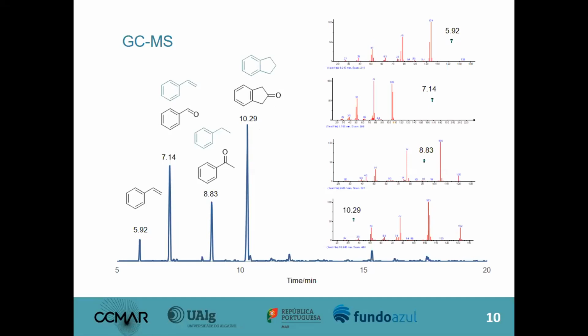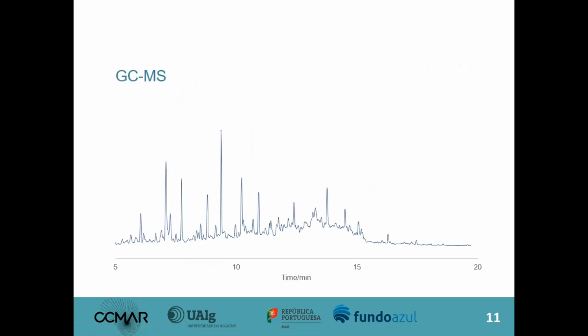So it is very important that we control the reaction, the thermal degradation of the polymer, in order to arrive at compounds that we can use to identify the polymers. So the nature of the compounds detected indicates what polymer is in your sample. And you can use any of those to make a calibration curve and quantify the amount, in this case, of polystyrene in your sample. Let us see one example here.